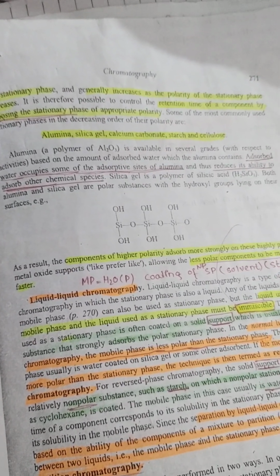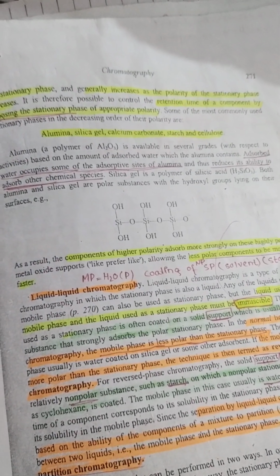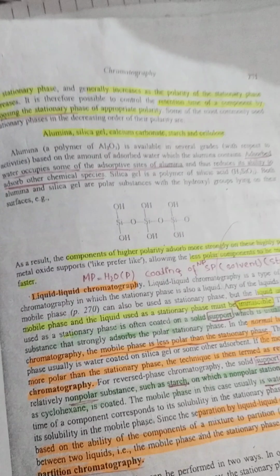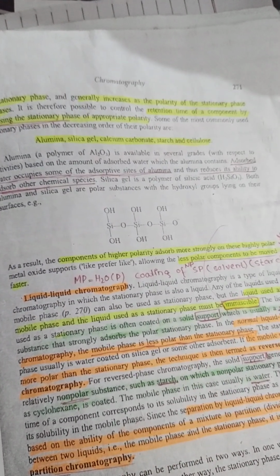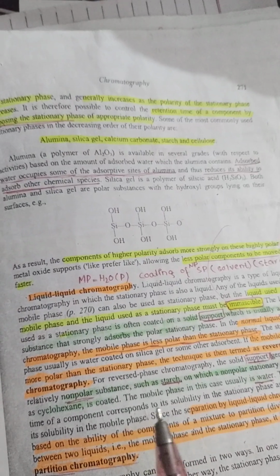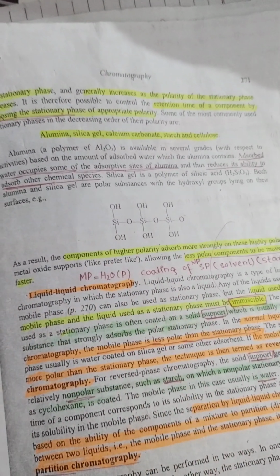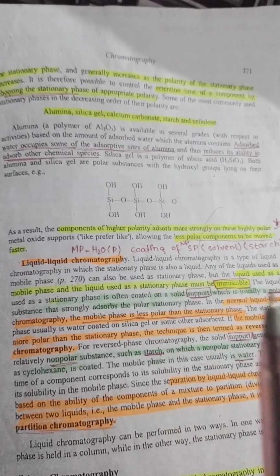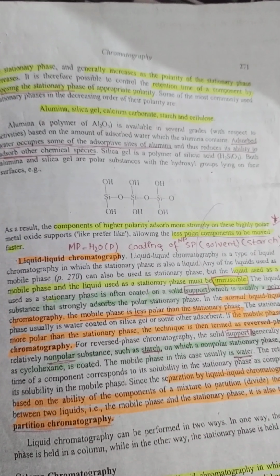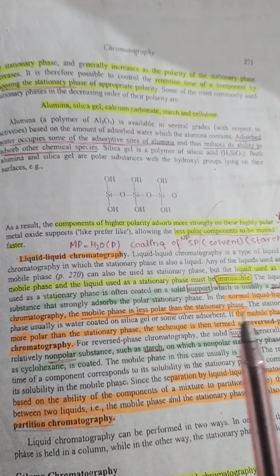That's why it's important to choose the different grades required for our technique. Next is silica gel, a polymer of silicic acid. Both are polar compounds and have hydroxyl groups that are important for tightly bonding to the polar components of the mixture. As a result, components of higher polarity adsorb more strongly on the polar stationary phase, and less polar components move faster.